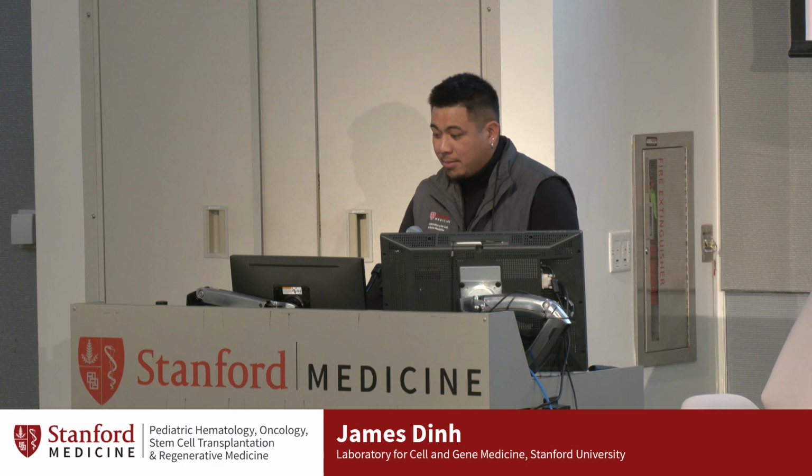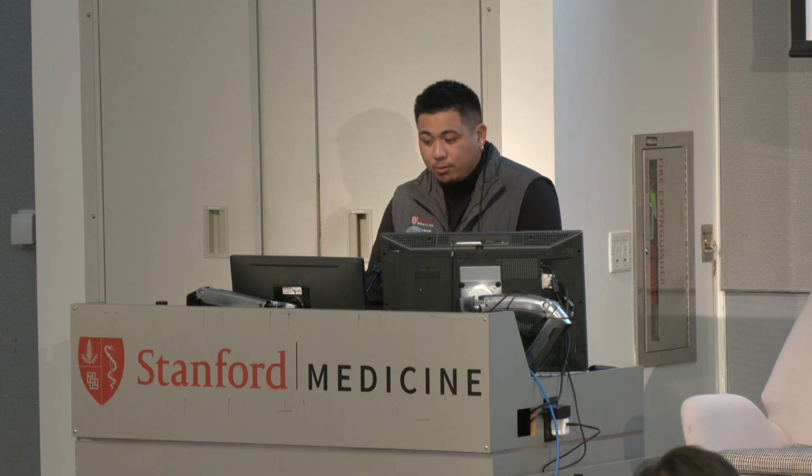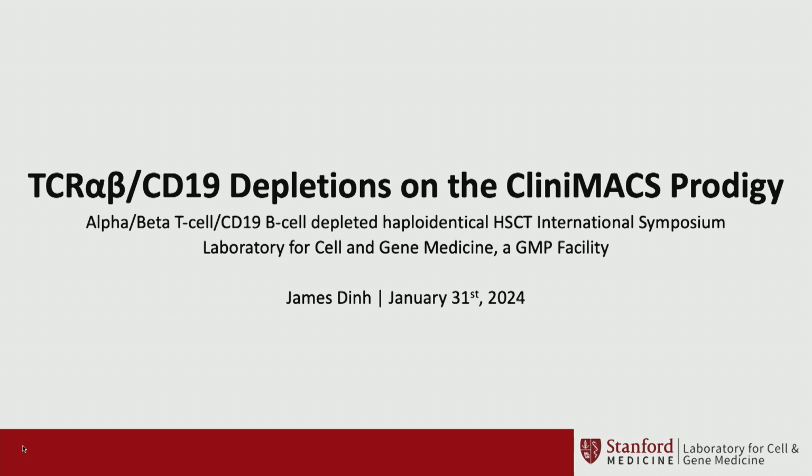Hi, everybody. My name is James Dinh, and I'm here to introduce you all to the TCR alpha beta CD19 depletions that we have done on the CliniMACS Prodigy here at Stanford's Laboratory for Cell and Gene Medicine, otherwise known as LCGM.